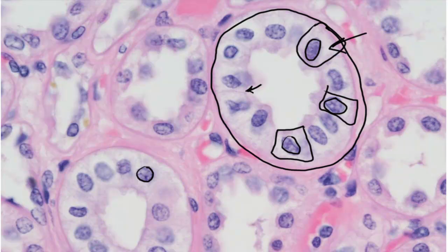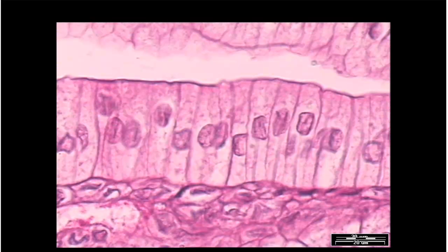Okay. So, let's look at our last example over here. And how do we know that this is a columnar epithelium? Well, we're fortunate with this particular image because the edges of the cells are stained pretty well. So, we can see here's the edge of the cell, down, go to the basal lamina, we come back up, and we see a pretty nice tall columnar cell. But again, we can look at that nucleus.